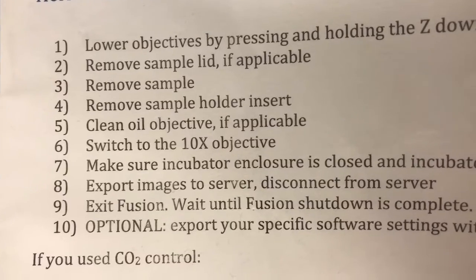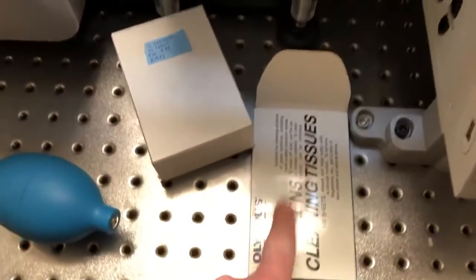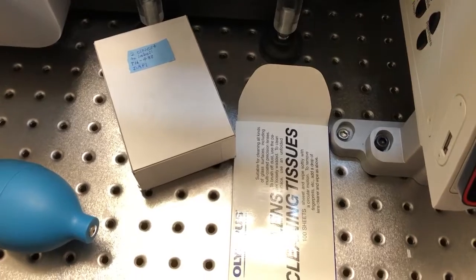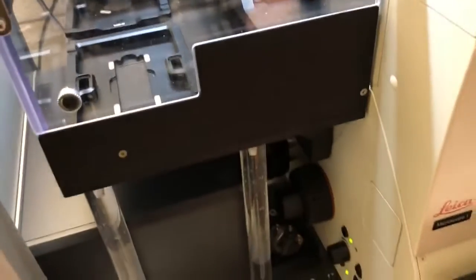Once we've removed the sample holder insert we clean the oil objective if applicable. To clean the oil objective we use lens paper, taking care not to touch the parts of the lens paper that we use to touch the objective. After wiping off the excess oil we use lens paper again with a little bit of 70% ethanol and use it to wipe the objective gently.